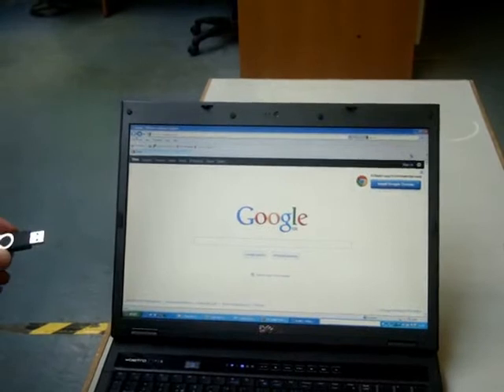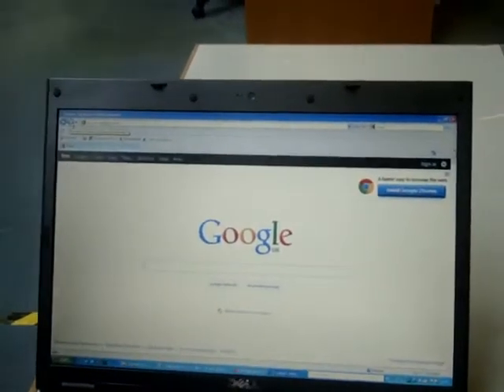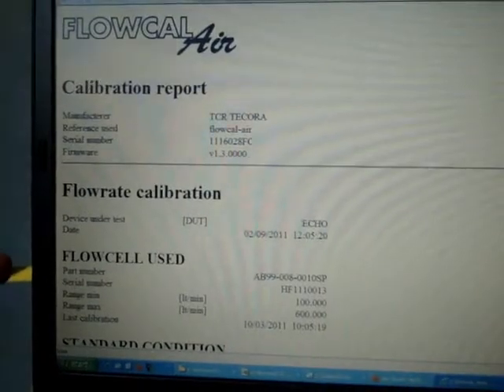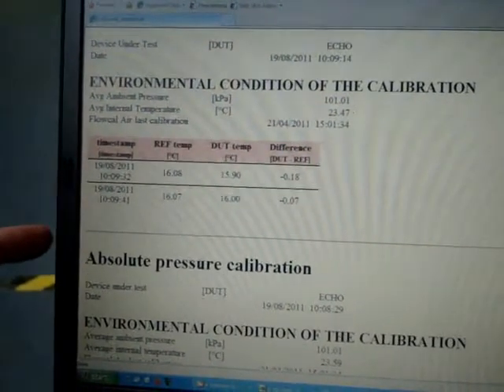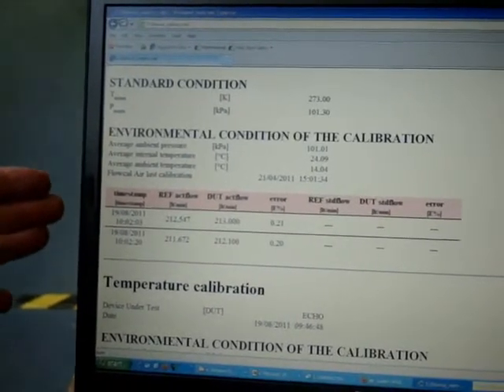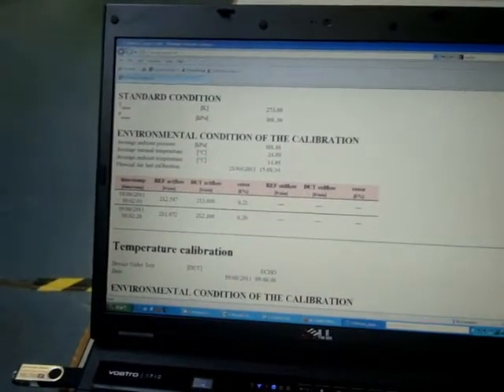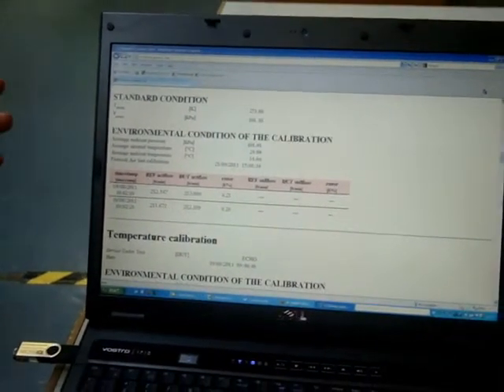To transfer the data from the memory stick onto your PC, simply insert the stick in the device and navigate to the appropriate page on the stick. That then shows a report indicating the device which was used and the device which was under test. The results for the individual checks of temperature, pressure, and flow are available to read, store, and print. The FlowCal Air gives a user an opportunity to measure all the essential parameters against a calibrated standard and produce a report simply and quickly.